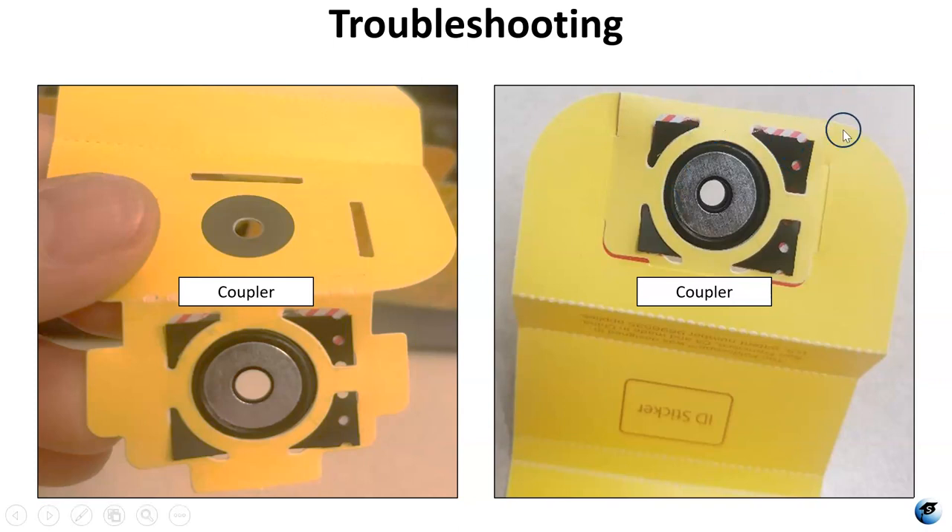Make sure the holes are on the side they're supposed to be on. There's a little paper bridge on each side, and one is longer — put the side with the holes on that longer side. This makes sure that everything lines up correctly and stays in place.